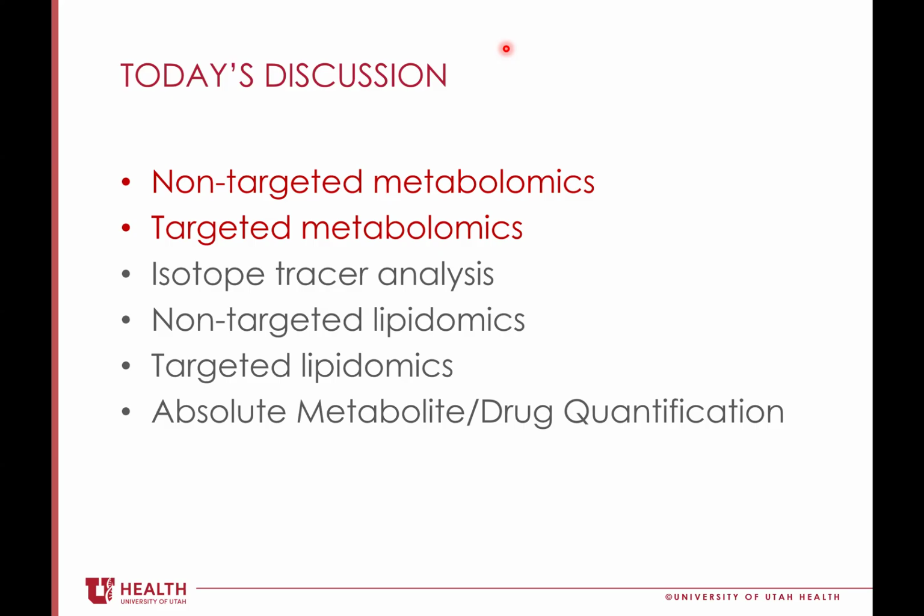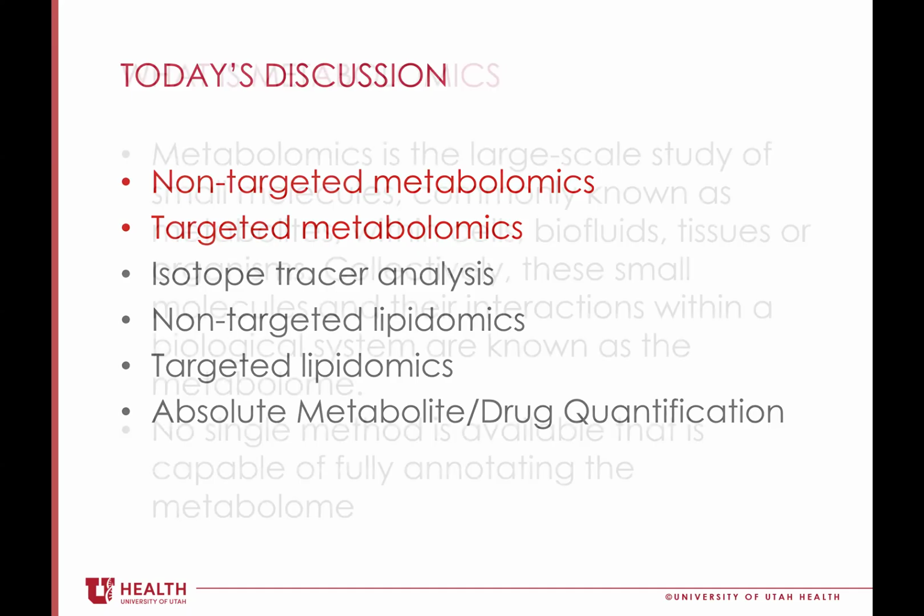We do a lot of isotope tracer analysis, but I'm not going to really talk about that. That's kind of its own special field. The same goes for absolute drug and metabolite quantitation. It's pretty expensive to do, and we do it, but it's not something I'm going to discuss since we don't do a lot of it.